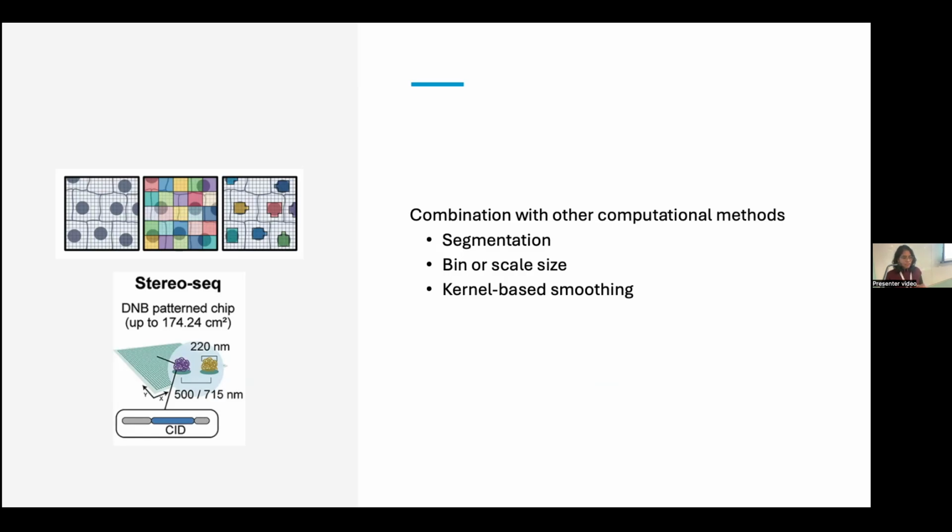And when the size is small, when you only have a 1 mm TMA core, the robustness with which the algorithm is able to smooth and identify domains is pretty much a little impossible. And I think I have an example of that soon.